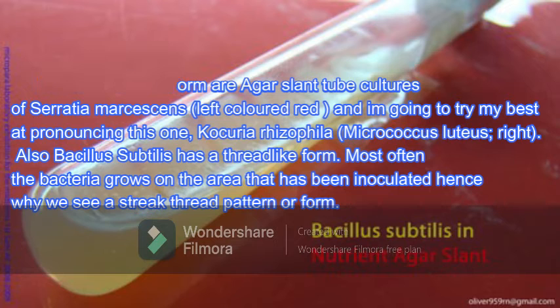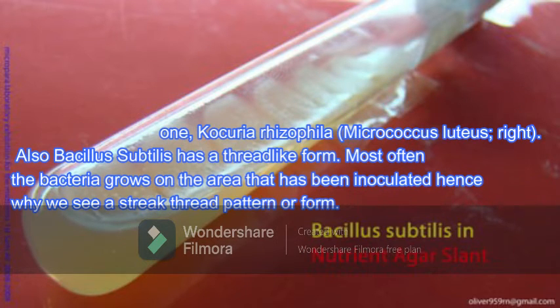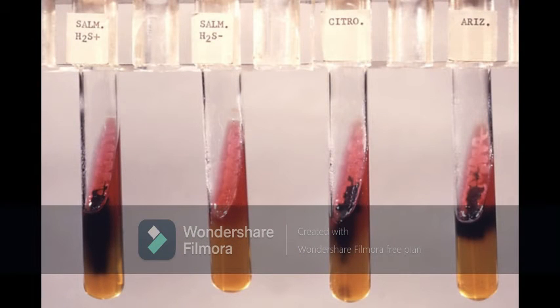Also, Bacillus subtilis has a thread-like form, and most often, the bacteria grows on the area that has been inoculated, hence why we see a streak thread pattern or form. Citrobacter and Salmonella, with the subspecies Arizonae, also have filiform, or thread-like growth following the trail of inoculation on the TSI slant. TSI stands for the triple sugar iron test.